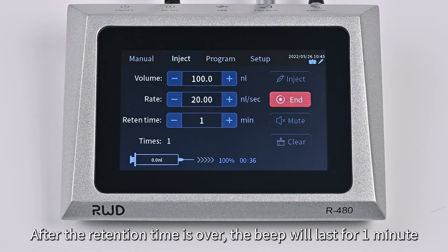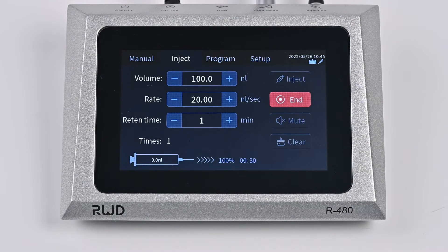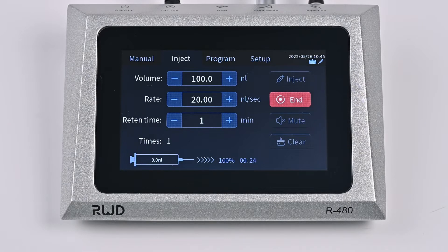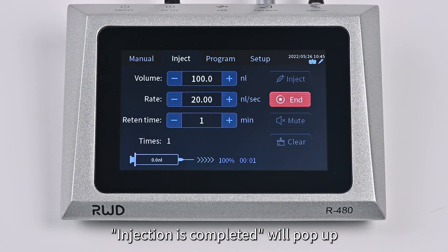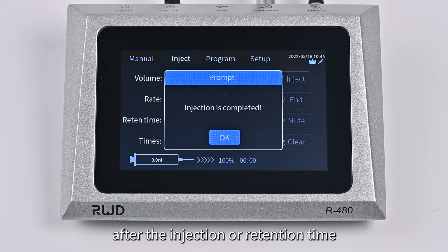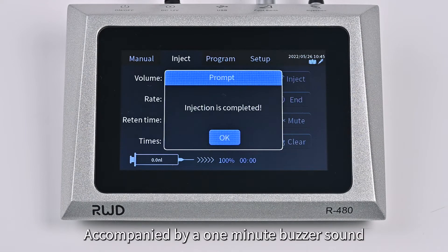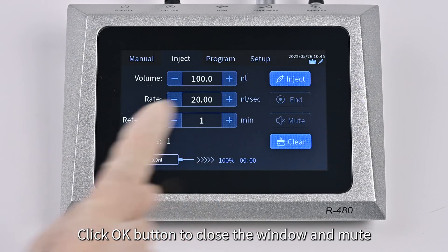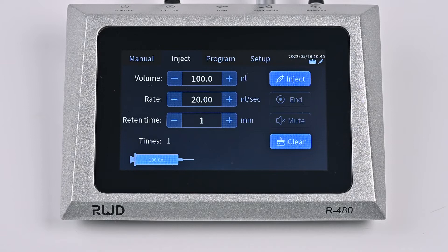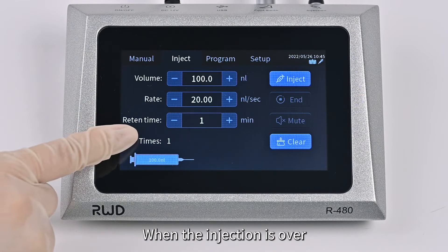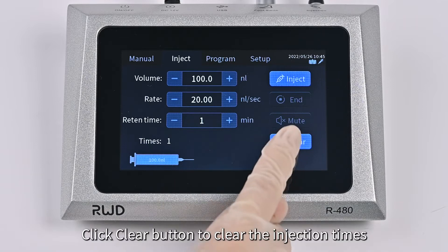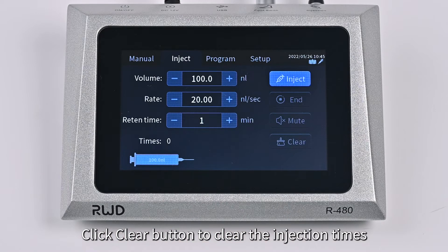After the retention time is over, a beep will last for 1 minute. When the reconfirmation function is enabled, an "Injection is completed" dialog will pop up after the injection or retention time, accompanied by a 1-minute buzzer sound. Click OK to close the window and mute. When the injection is over, the system will automatically record the number of injections. Click the Clear button to clear the injection count.